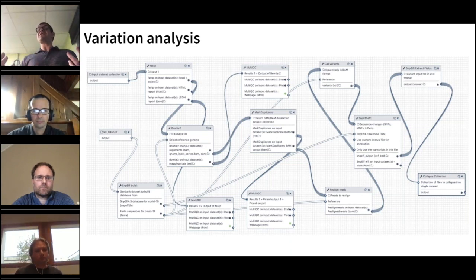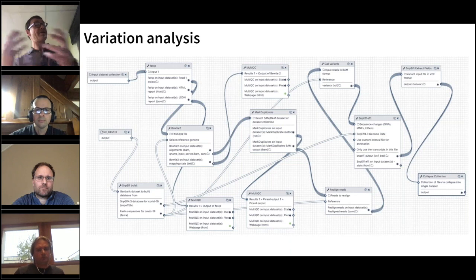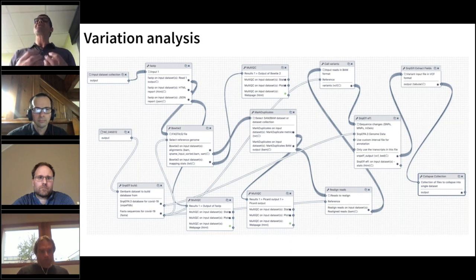You're going to have variants at every site. So how do you decide which ones are good and which ones are not so good? That requires a certain logic, because again, it's a special case of variant calling, and we're going to dedicate the entire webinar to that problem: how to properly call variants in viral mixtures.